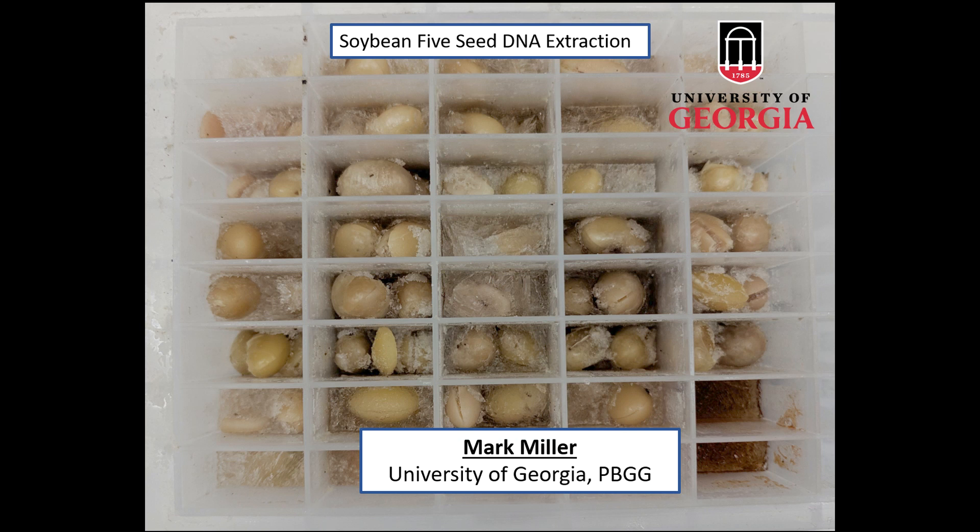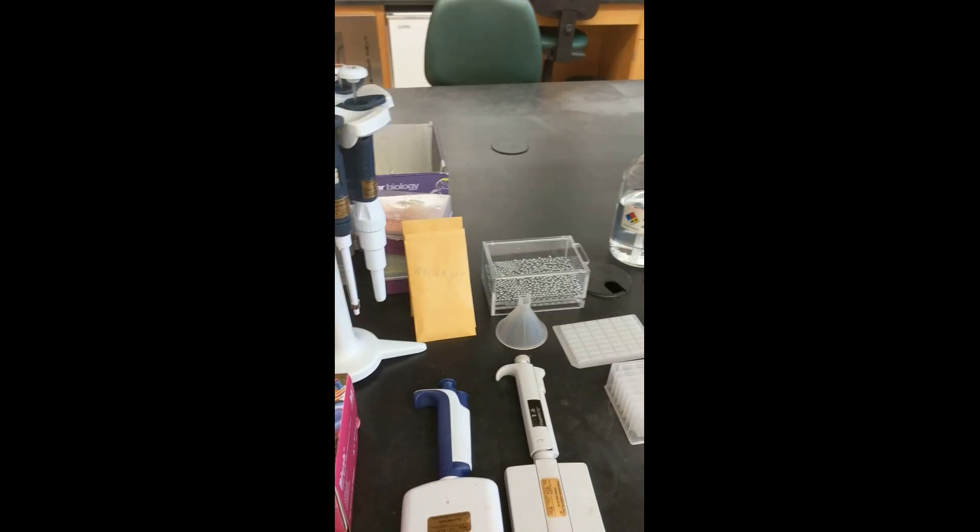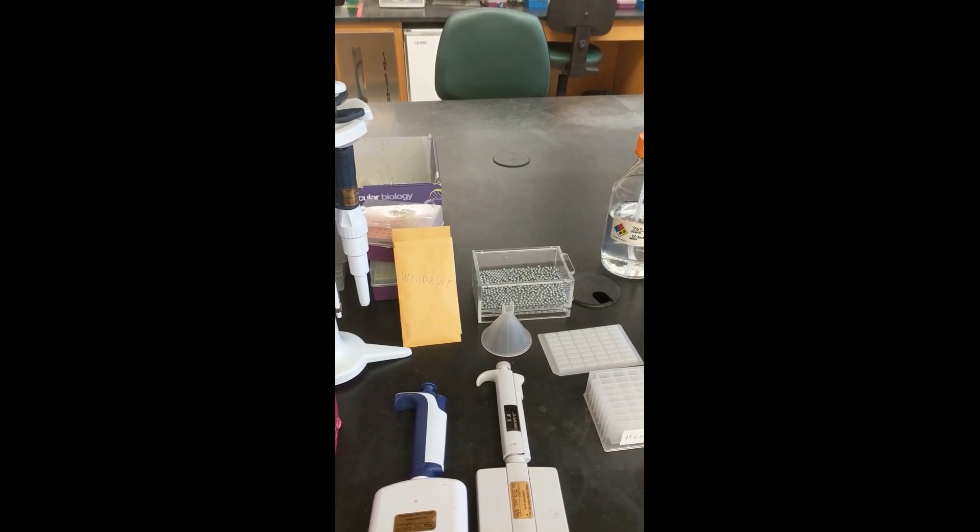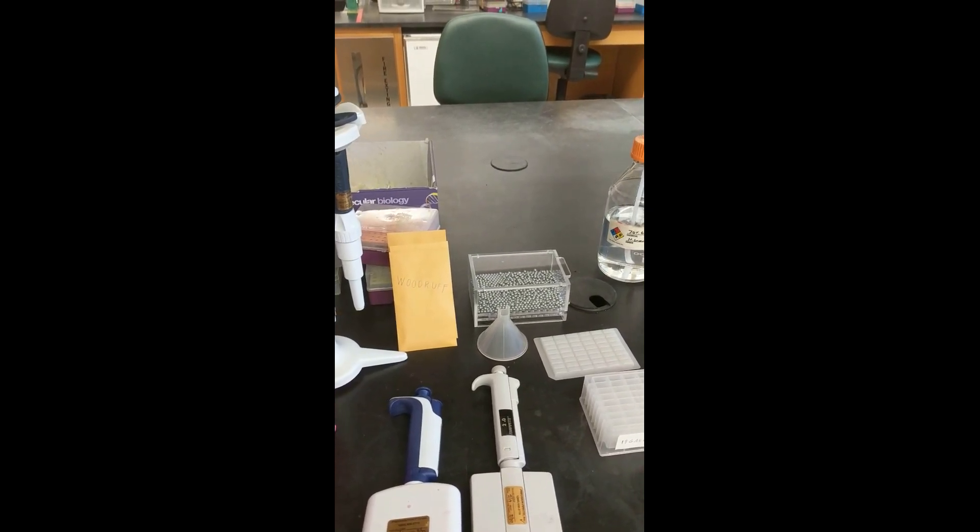Five-seed DNA extraction is a relatively high-throughput DNA extraction method that requires very little specialized equipment and is relatively robust. Hello, today I will be displaying how to perform a five-seed DNA extraction for soybean seeds.